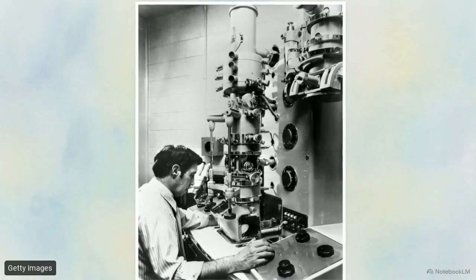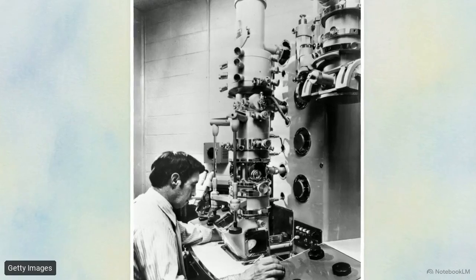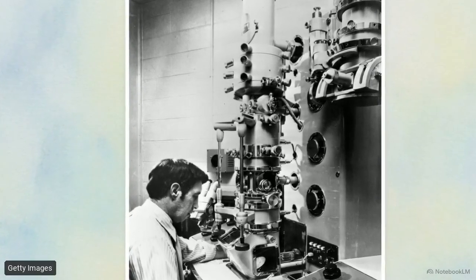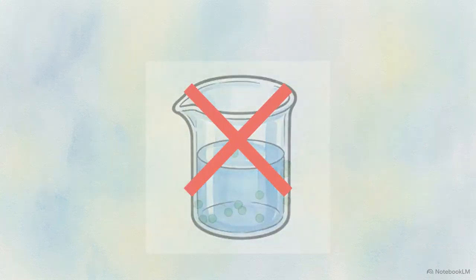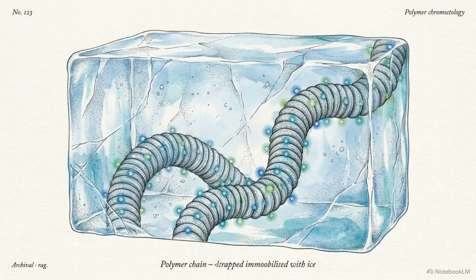Achieving sub-nanometer spatial resolution in material science has historically required the sheer scale and immense power of traditional electron microscopes. Extracting this level of detail carries a heavy physical cost. To be imaged, samples cannot remain in their native state. They must be frozen, desiccated, or locked inside a hard vacuum seal. This rigorous preparation creates an illusion of stasis.